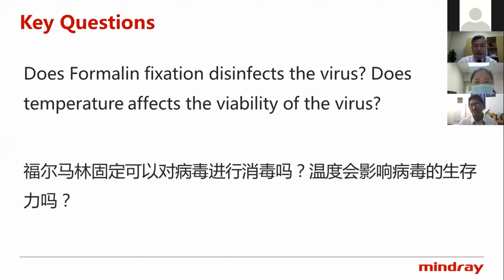So on specimen management, the biosafety level should be the highest for those specimens collected from open airways, from the respiratory tract, including when we use a bronchoscope. This biosafety level should be the highest.